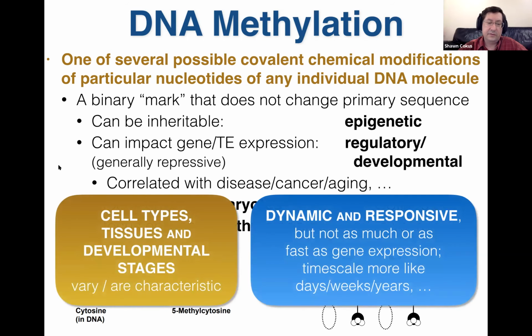So yeah, there tend to be characteristic patterns across cell types and tissues and developmental stages. And the methylation state is also dynamic and responsive to external stimuli. It's not nearly as fast as, say, gene expression is. The time scale is more like days or weeks or years, but it is dynamic.